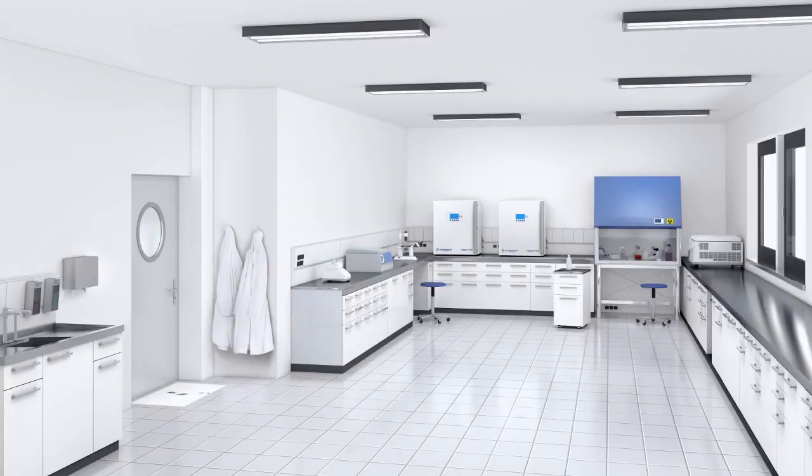In order to understand cell culture, we have to virtually explore a cell culture lab. So here is a cell culture lab. You can see the essential components. It should be very clean and tidy. In this cell culture lab, in the right hand corner, you can see there is a biosafety cabinet. All the actions would take place here. Before looking at the biosafety cabinet, let us look at other components.